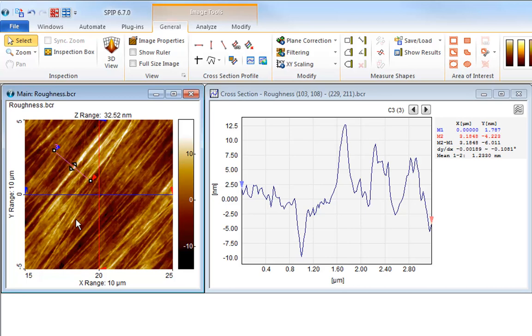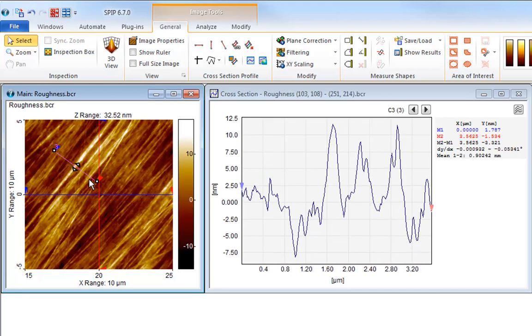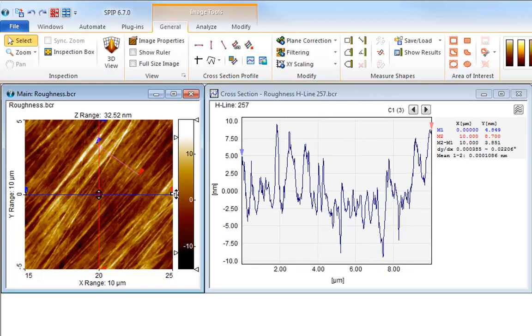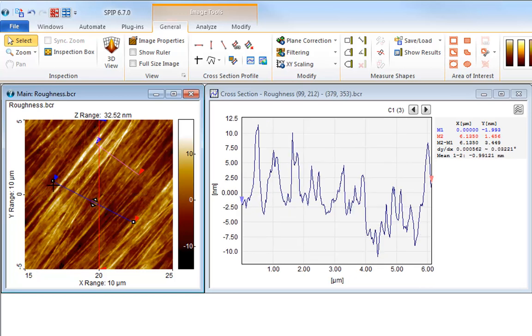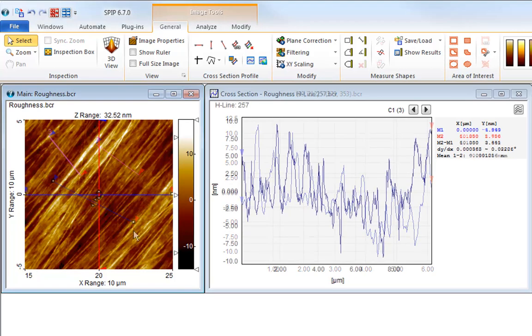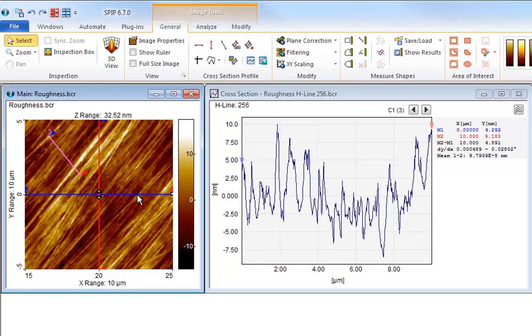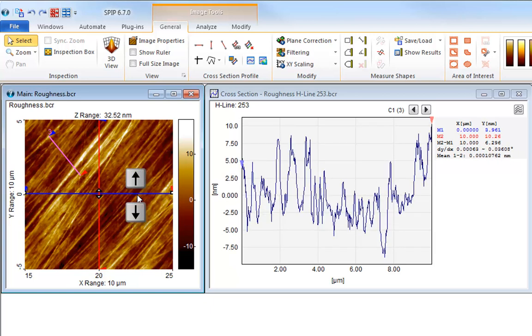All cross-sections can be moved around and their endpoints can be positioned freely. When a cross-section is selected in the image window, you can move it up or down one scanline at a time using the keyboard up-down arrow buttons.